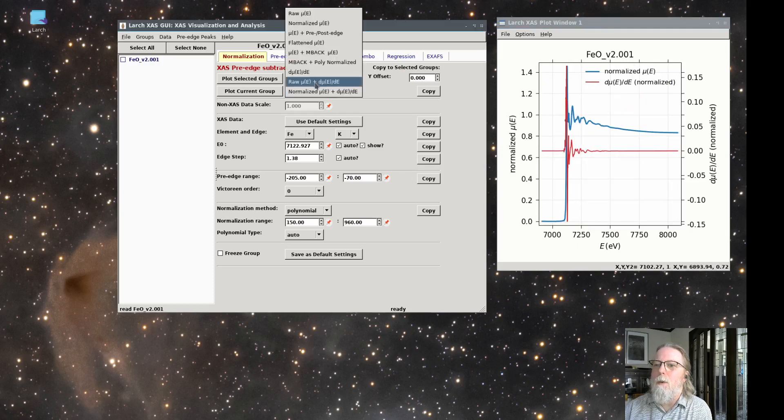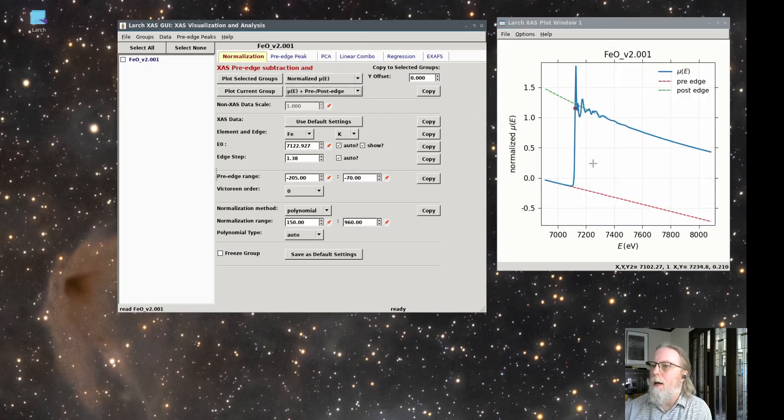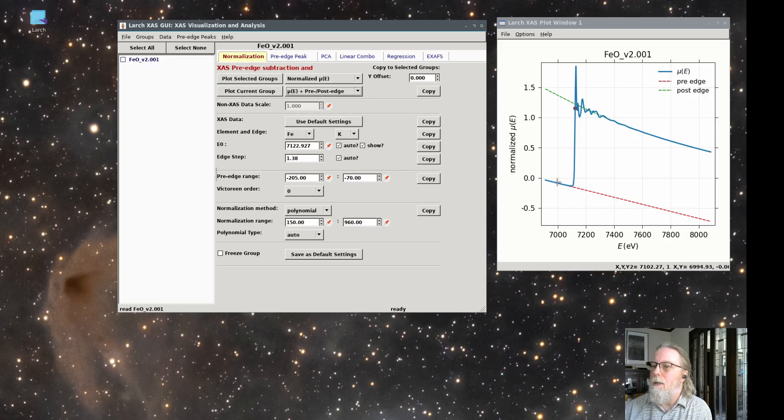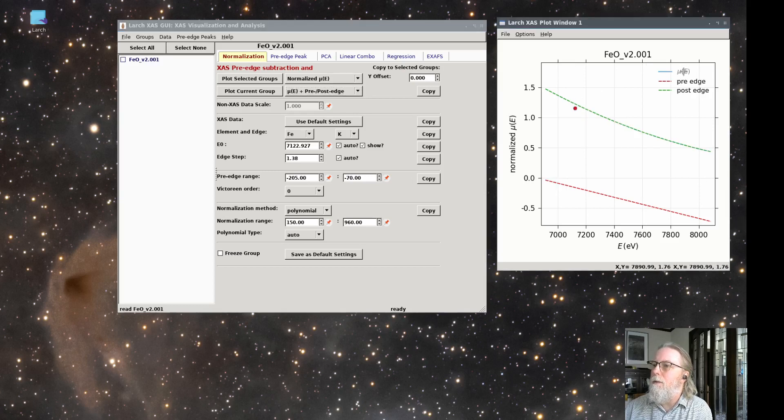So let's plot mu of E with the pre and post edge lines that's shown here. So now we see the raw data mu of E in blue and a pre edge line and a post edge curve here in red and green.